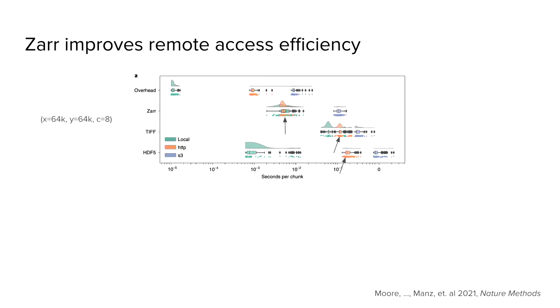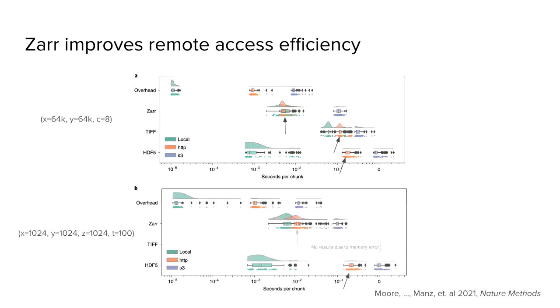And this is really illustrated by the previous illustration, because over the network, you no longer have to both read the header and seek. You can access these chunks directly. And so ZARR serves as a better cloud-friendly option for these data. I do think it's important to note that HDF5 locally is super performant, but it is these trade-offs of both a local read and remote read choice that I think are compelling about ZARR in this context.